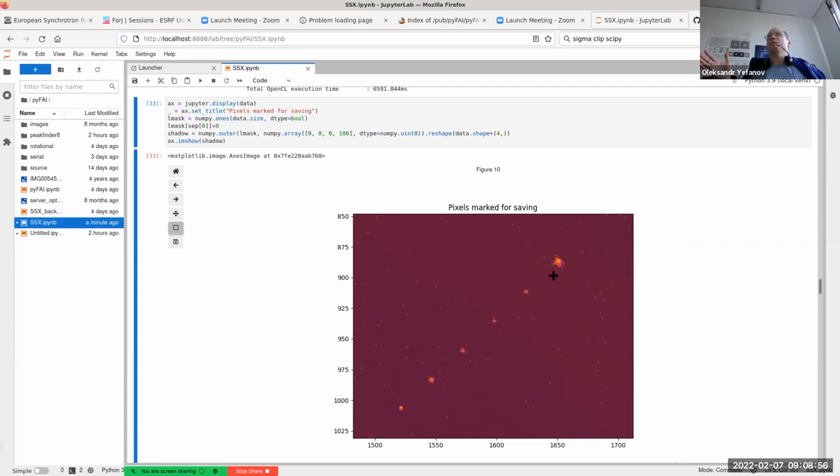We were testing this 5-7 years ago, and then you just cut your resolution to what you can see. That's true. If you cut at 2 sigma, you're limited at 2 sigma. Okay. Well, it's fine if there is no other way. The alternative is running 10 times slower, or the other alternative is buying more computers and faster transfer.